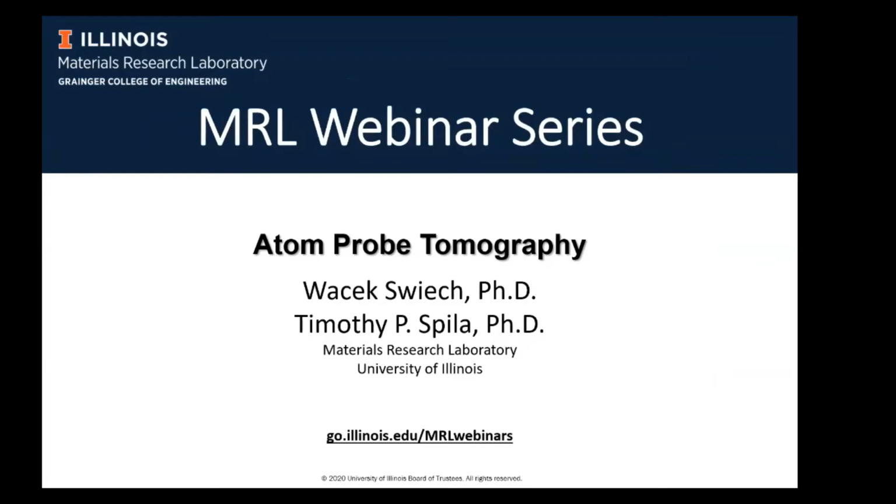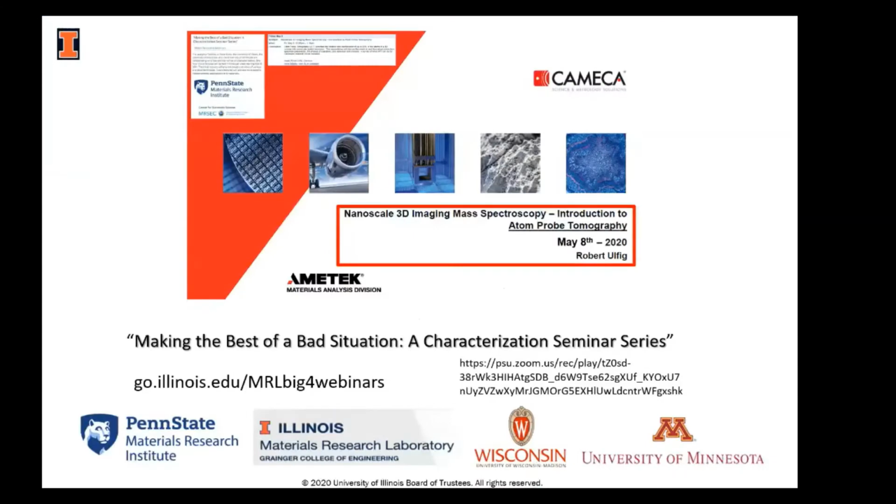start with some presentation of insight into physical foundation of the technique, followed by description of sample preparation, which is very close to that of, partially at least, to that of focused ion beam technology, which was presented a week ago in the same series by Dr. Zhou.